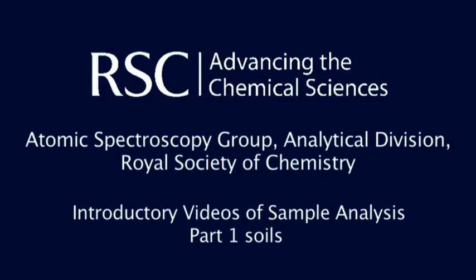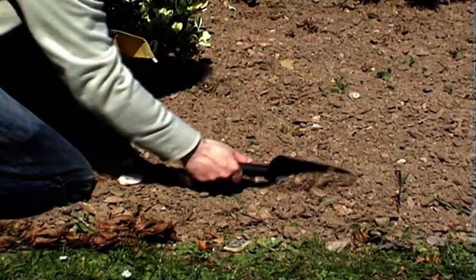Welcome to the Royal Society of Chemistry Atomic Spectroscopy Group's introductory video on sample analysis. The aim of this two-part video is to provide a step-by-step guide to the analysis of common materials. Part 1. Soils. The first step is to select a suitable sampling site.